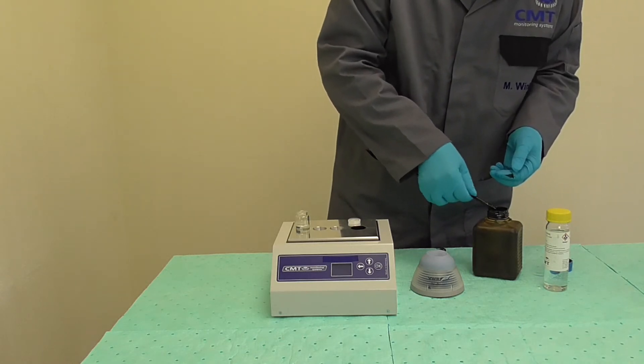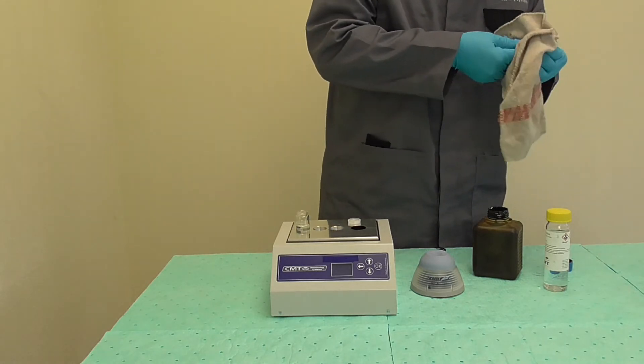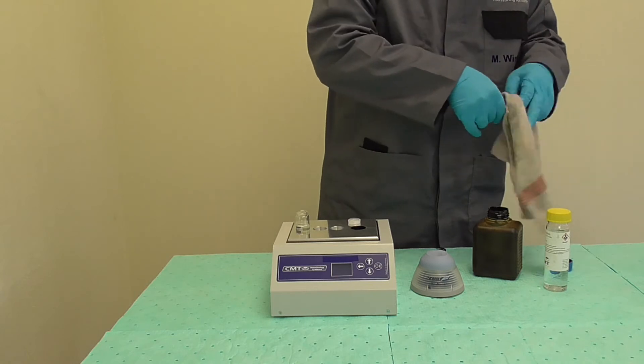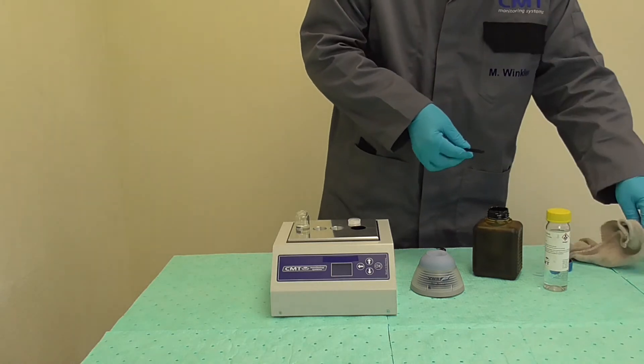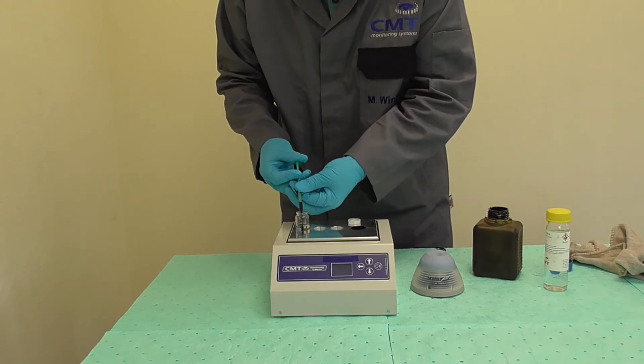Empty the syringe and refill it again a few times. Wipe off the syringe from outside with a cotton rag before you add the fuel to the vial you filled before with reagent J.